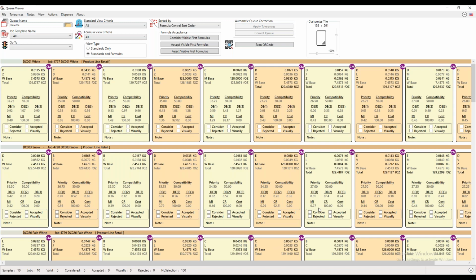You can also see that below this area, I have a status bar down here at the bottom. It says samples 10, jobs 10. Each one of these would be a job. And then there's some markings that we have through here as far as if anything's been selected and how they've been selected. And I'll explain that in a little bit, but it will give you a status of where you're at to make sure that you don't get lost as to what you're in the middle of doing when dealing with a number of different formulas.